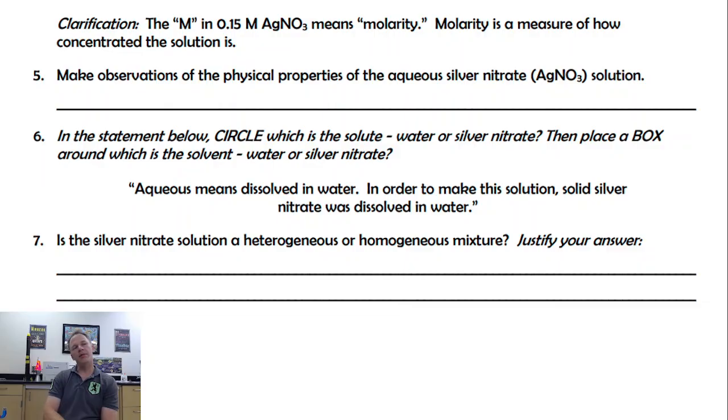On the first day of our lab, I told you that we were using weak silver nitrate solution. We were using 0.1 M AgNO3. But then the second day I came back and I said that I made it stronger. I added some silver nitrate to make it 0.15 M AgNO3. And I'm glad I did, because the crystals that we got were much cooler with the more concentrated silver nitrate. So what do you think M means in this case?